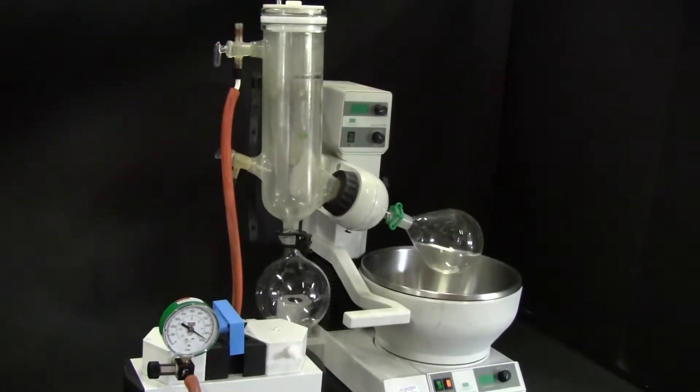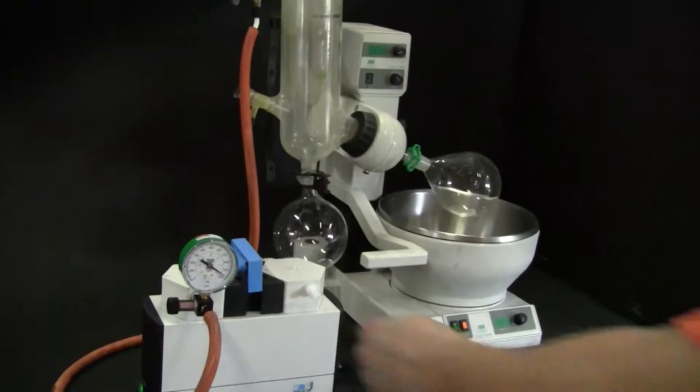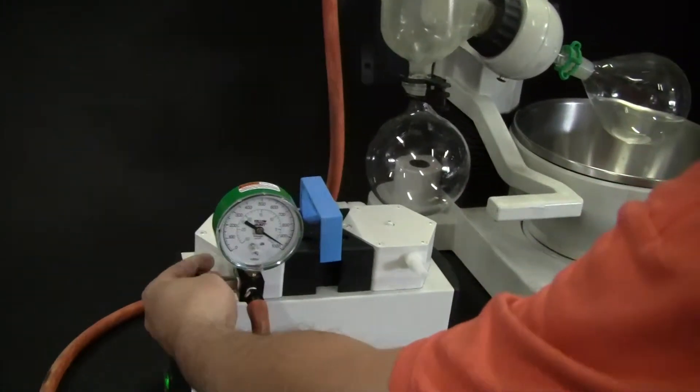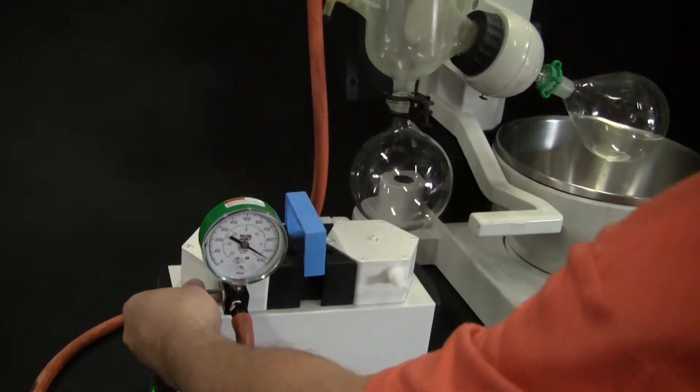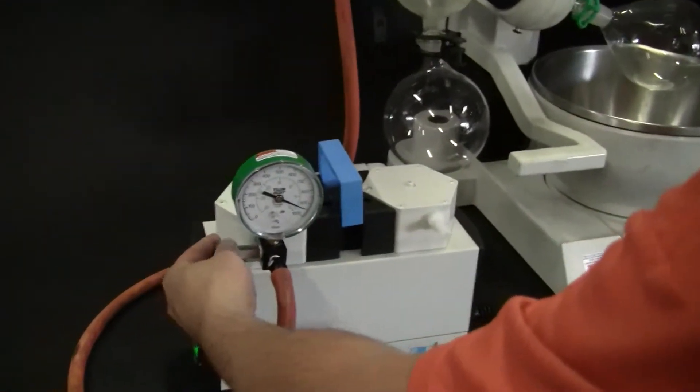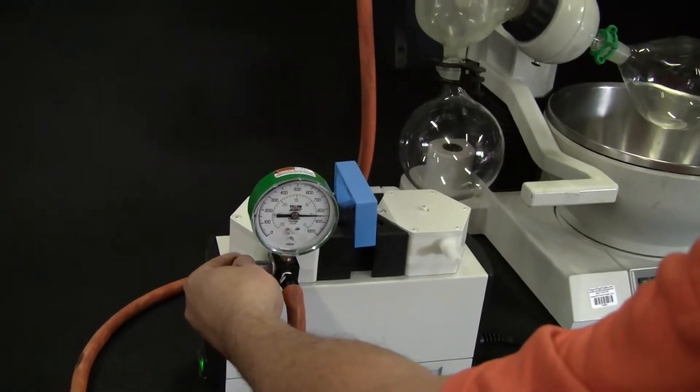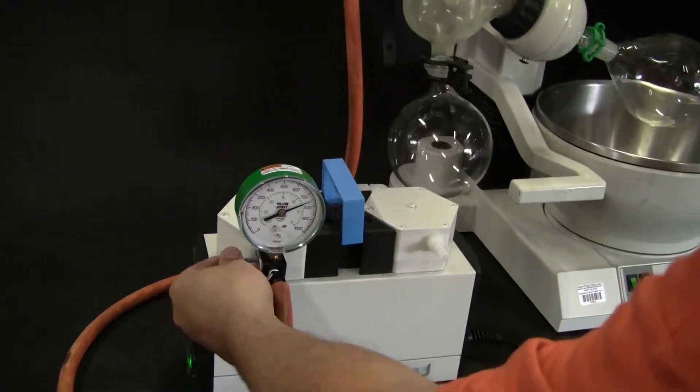And what I'm going to demonstrate now is, if I just want a little vacuum, I can dial that in. I'm going to try to get it down to about 700. Gauges in millibars, it's quite nice.